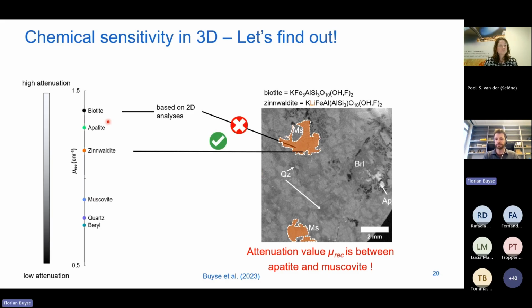The case here was, since I cannot measure lithium directly with SEM-EDS, due to this one little element, you can see that actually the attenuation coefficient can already lower quite a bit. This was later verified, and indeed, I found out that this mineral, which was first thought to be biotite, contains some lithium, and really this reflects as well in your attenuation data. And this is something I'm working on right now as well, to look into the distribution of lithium within minerals, mostly in pegmatite rocks, since this was an interesting find during my PhD.